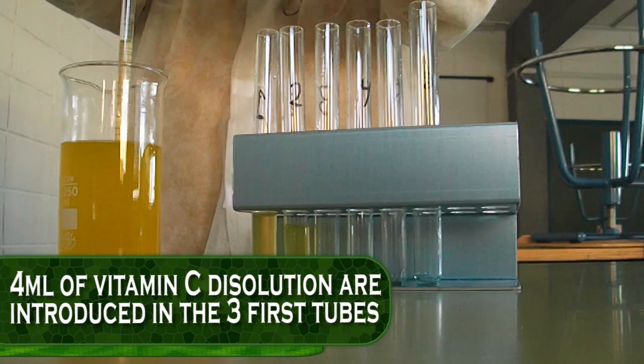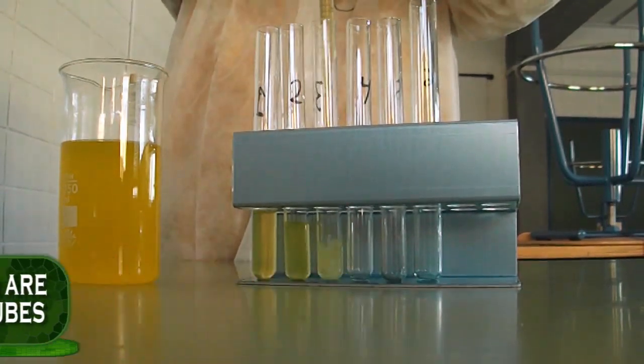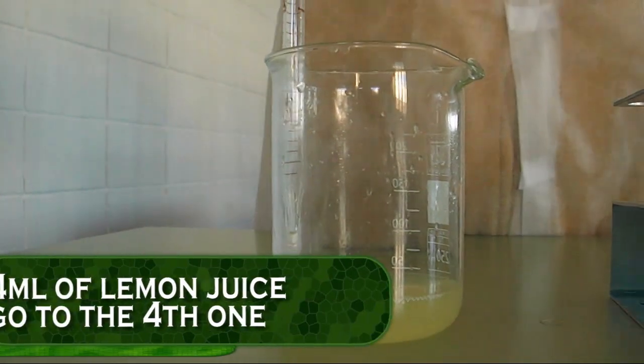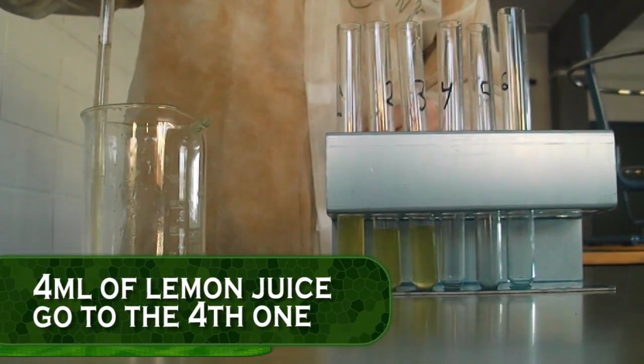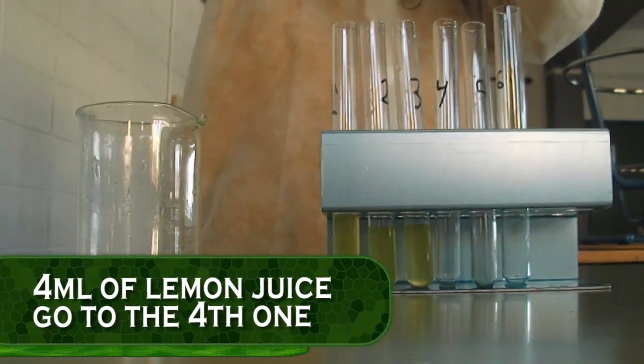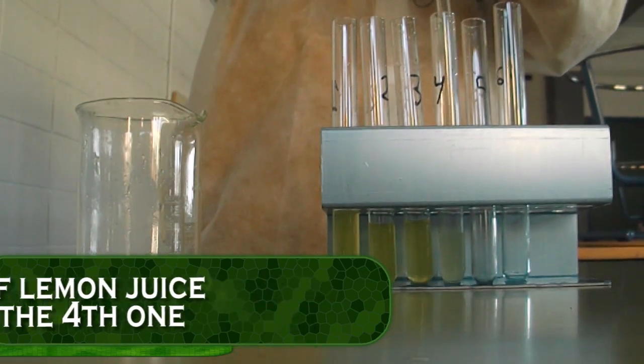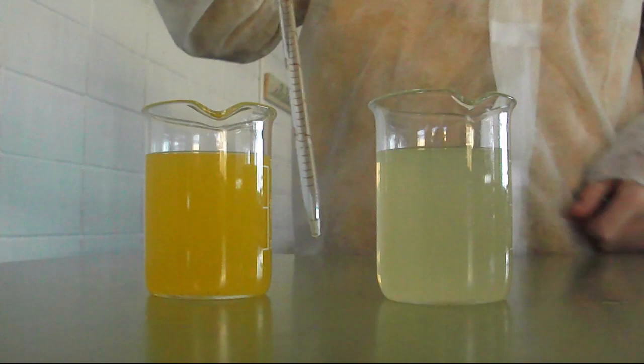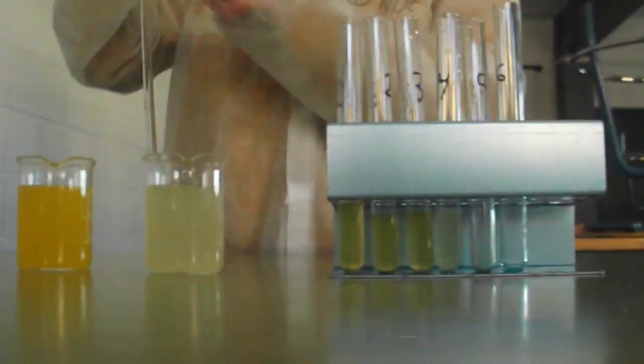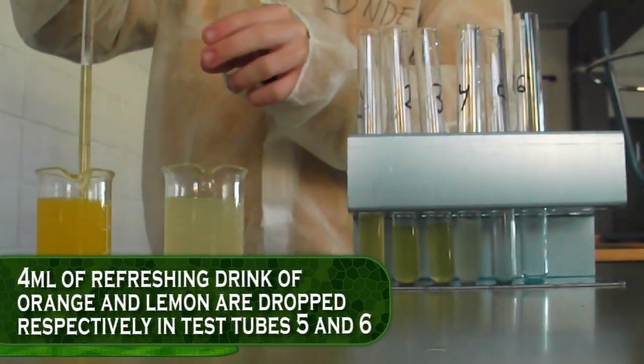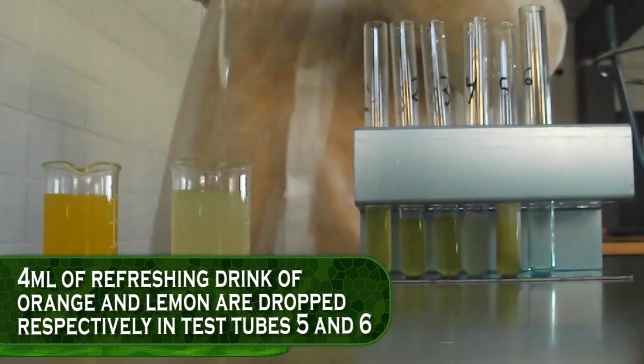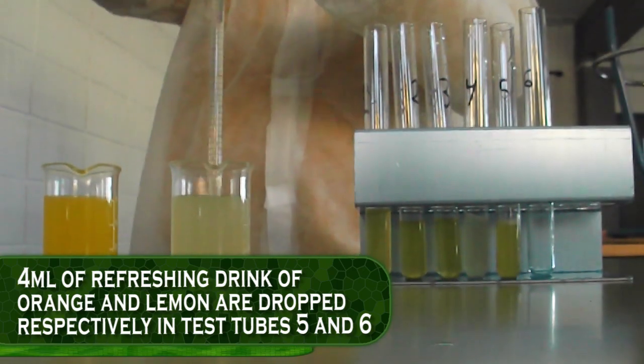4 ml of lemon juice go to the fourth one. 4 ml of refreshing drink of orange and lemon are dropped respectively in tubes 5 and 6.